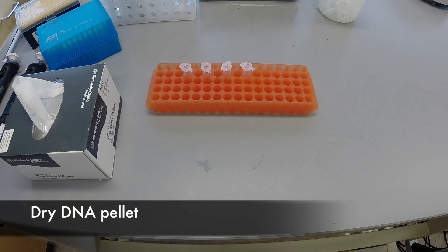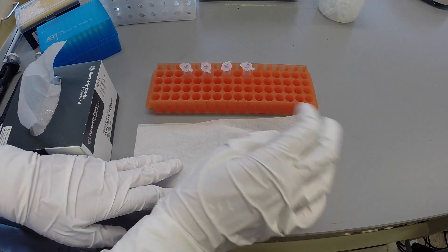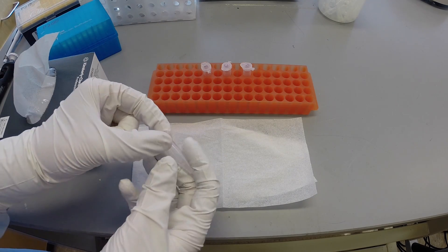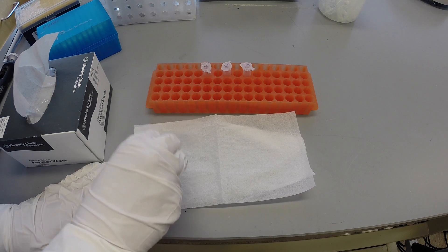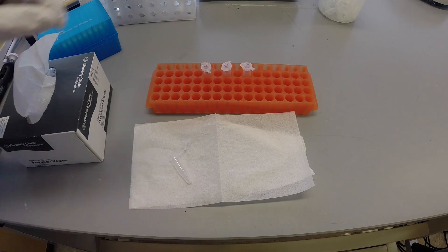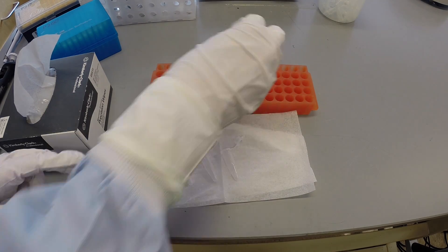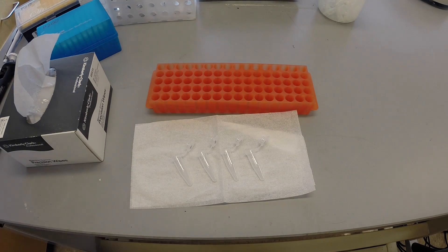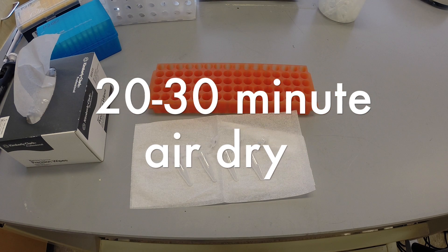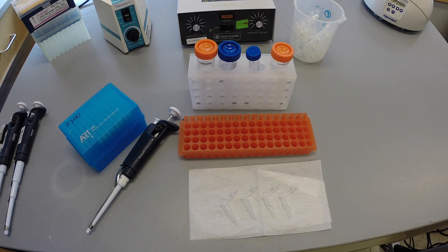Lay out a few layers of Kim Wipes. Open the tube and knock it onto the Kim Wipe to remove any large volumes of solution still remaining. Leave the tube open and lay it on its side to evaporate any remaining solution from the pellet. Repeat this process for all remaining samples and allow them to air dry for 20–30 minutes. If the tube still has spots of solution or if the pellet does not look dry, allow evaporation to continue.